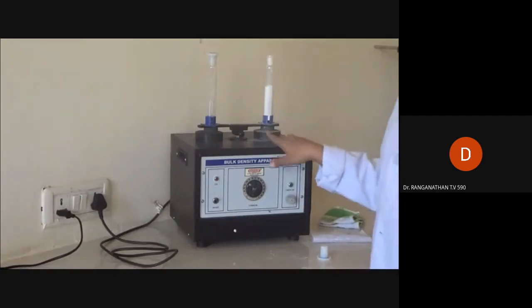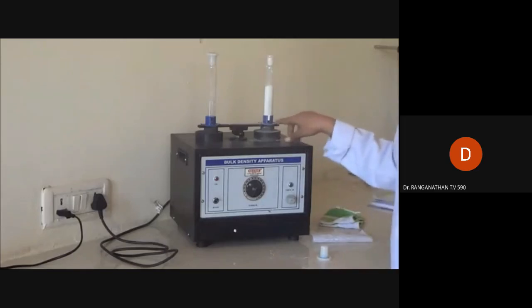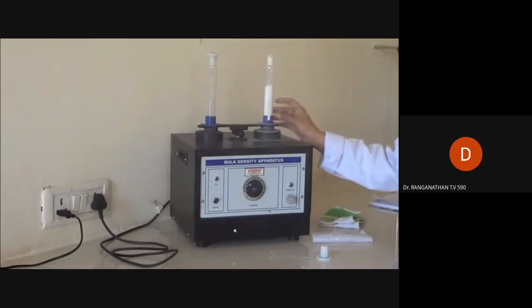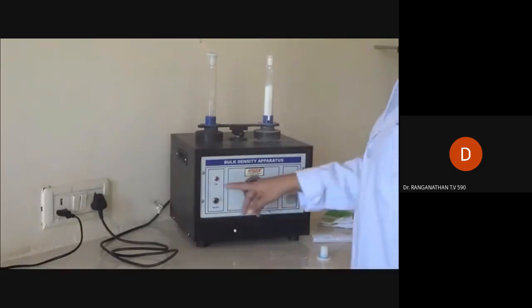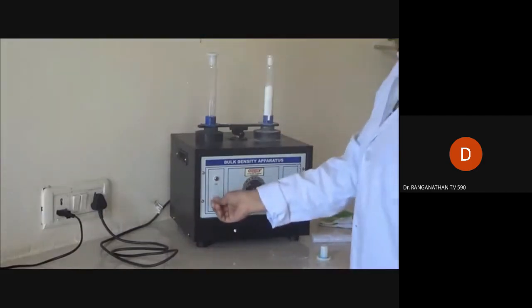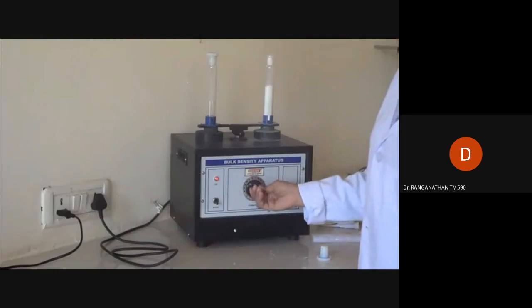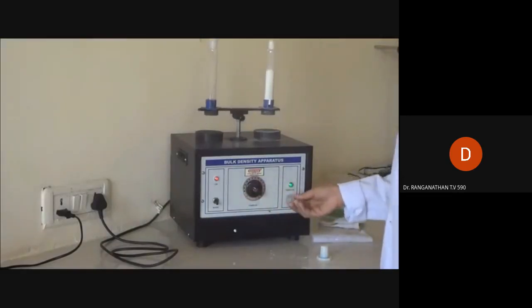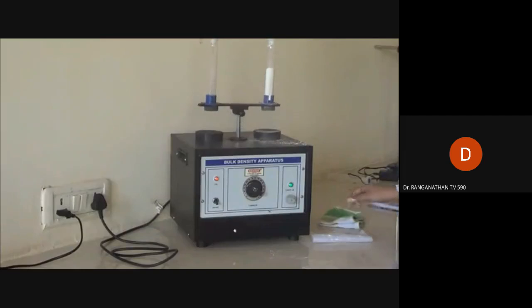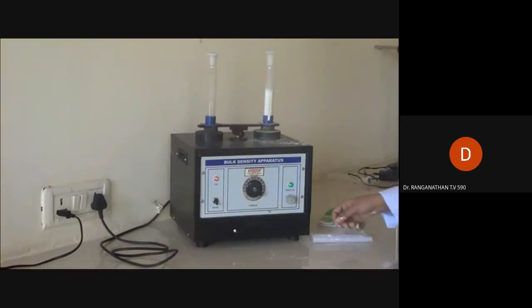Now for tap density, we need to tap this cylinder around 100 times so that the powder will settle properly in this measuring cylinder and we will calculate the tap volume. So for that we have to transfer the cylinder into the apparatus, then switch on this bulk density apparatus, set the time period for around 20 minutes and tapping will start. Here the number of tappings per minute is given by the standard AOAC.